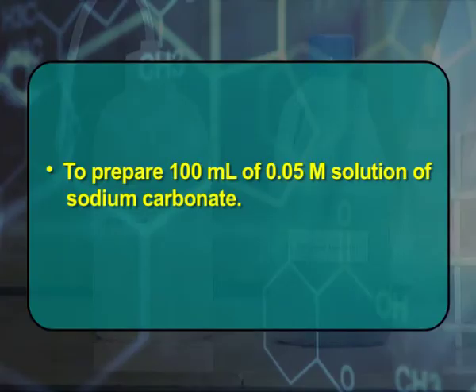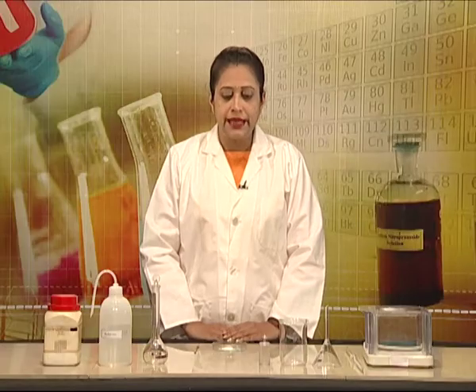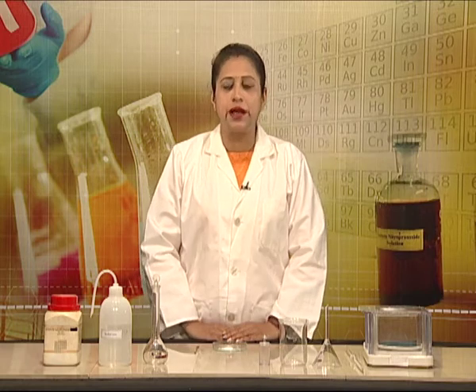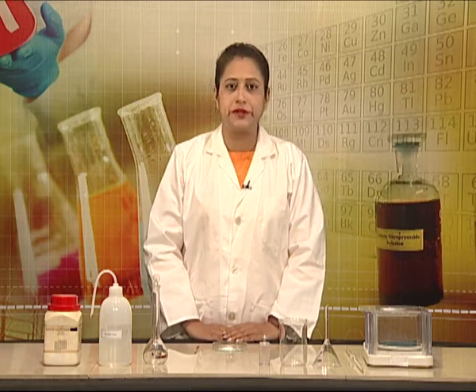Our aim today will be to prepare 100 ml of a 0.05 molar solution of sodium carbonate. Let us see what apparatus is required for the purpose.